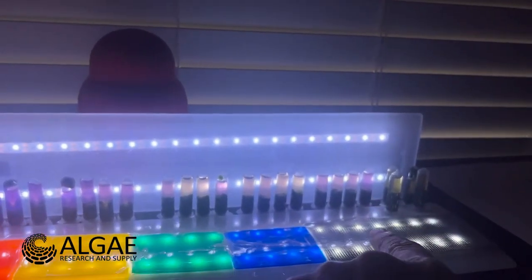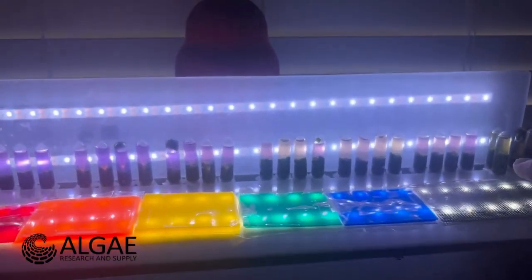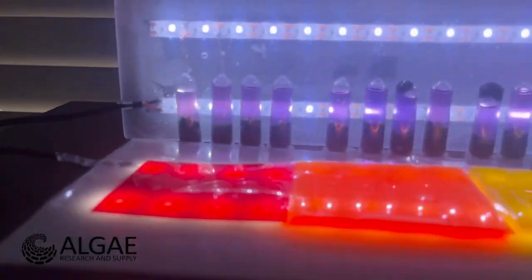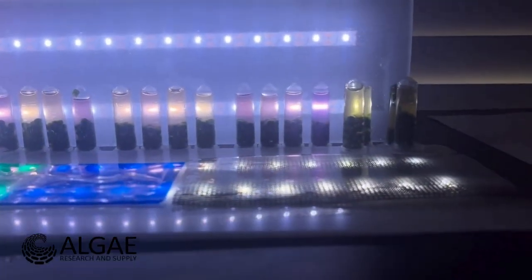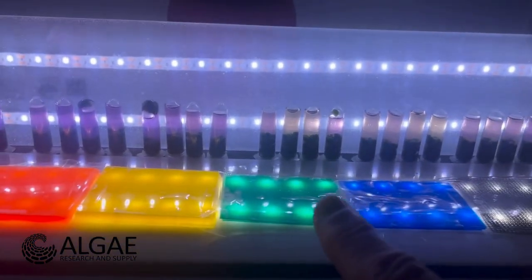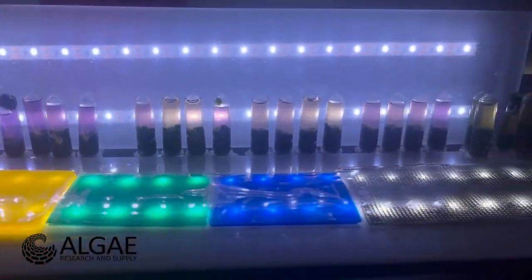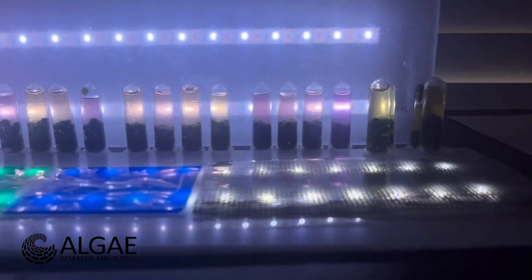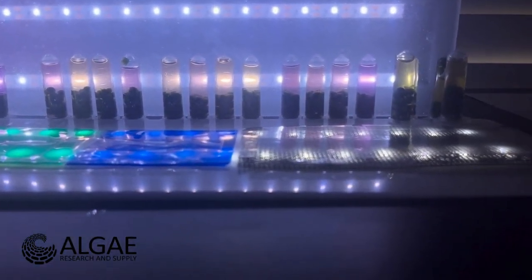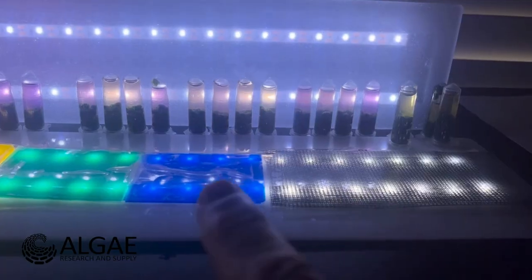My theory on why the bright light, or the white light, was less changed in color than the red is that it's spread across the entire spectrum. And there's a lot of things like here in the green and in the blue light that wasn't as significant for being responsible for photosynthesis. But for the white light, we counted the total number of photons, which includes the green and blues.